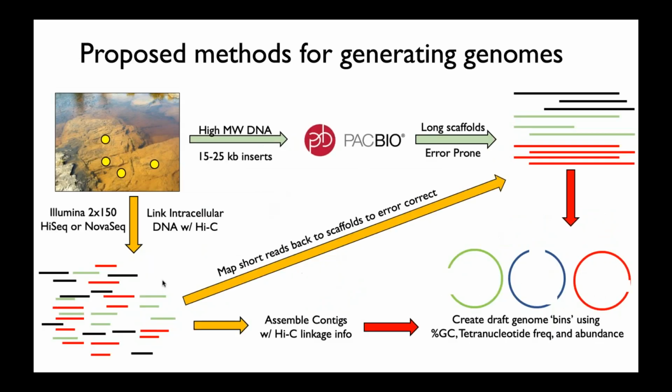And so what we're proposing to do here is generate some high molecular weight DNA and long scaffolds from these sorts of environments, and use the PacBio platform for that.